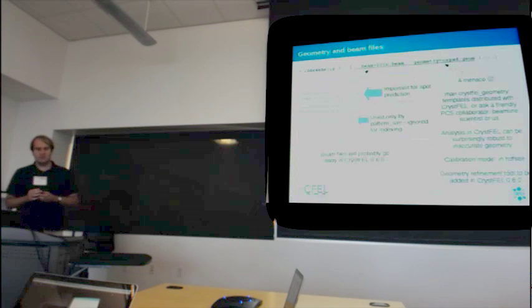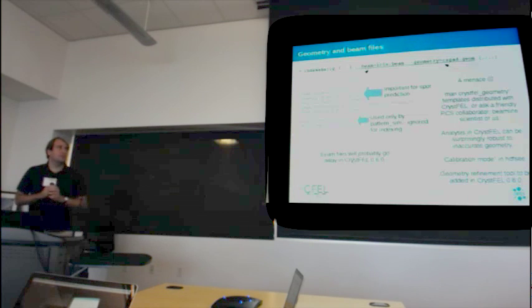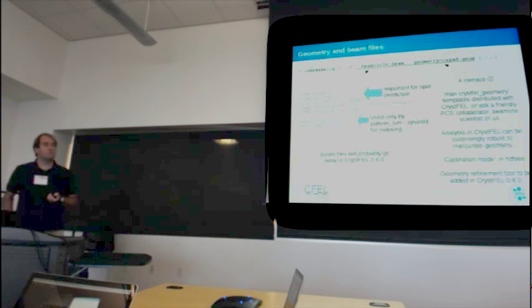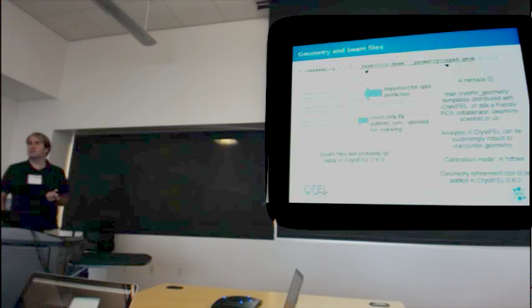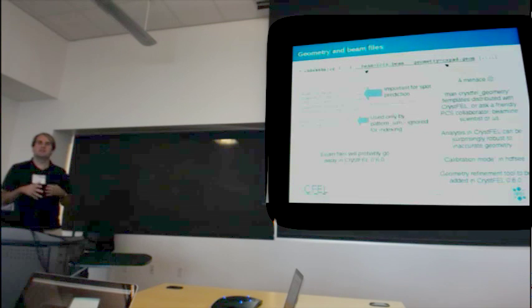Right. We need a bit more information than what's in the HDF5 file. And this comes in the form of the beam and geometry files. So when you run indexamajig, you give it --beam=, and this is the file name of the beam file. Inside the beam file is a very simple seven-line file. It contains the bandwidth, divergence, and this profile radius, that's the radius of a Bragg reflection in reciprocal space. These parameters are important for the spot prediction step, so when we calculate which reflections should appear in the diffraction pattern. So we might have to tune these a bit.